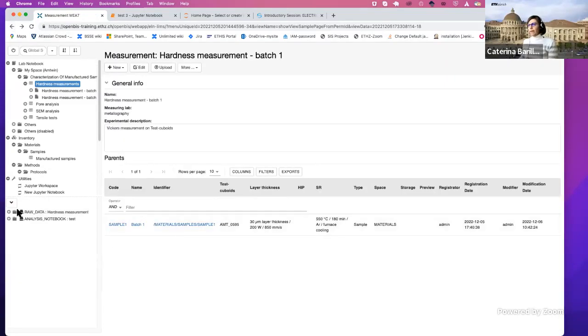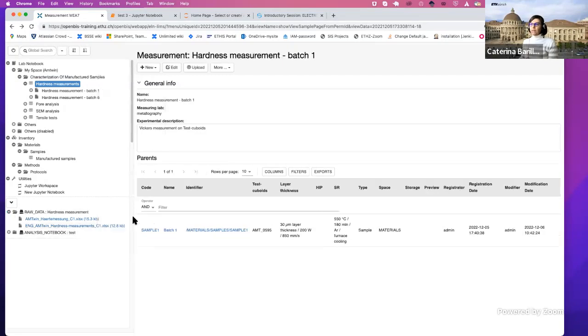And then if I go back, I see that here I have attached the data, which are the Excel spreadsheets. So in this case, this is what I have done: I have attached the data sets as Excel files. I don't know if it would make more sense to have the information contained in those files as metadata here, and then have all the values filled in. This is also a possibility.